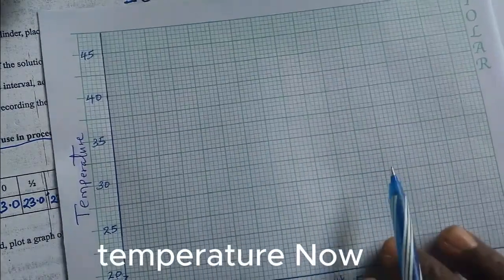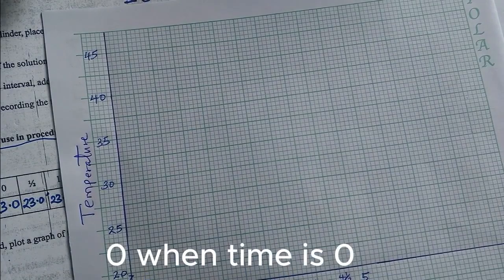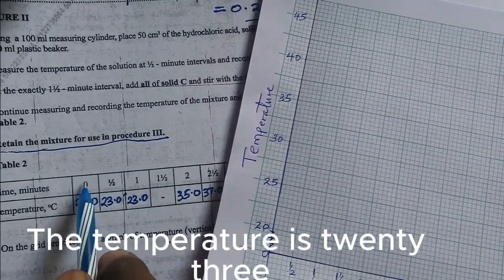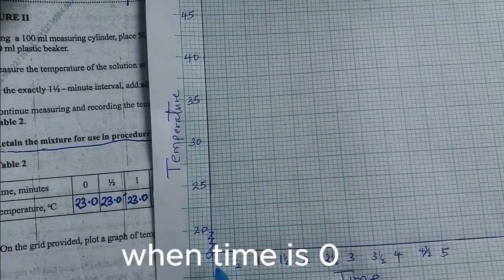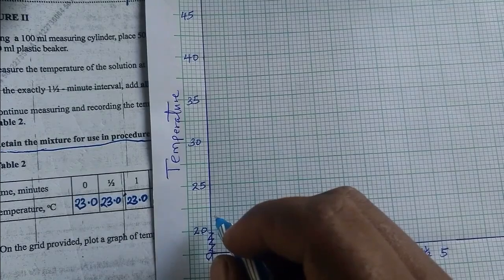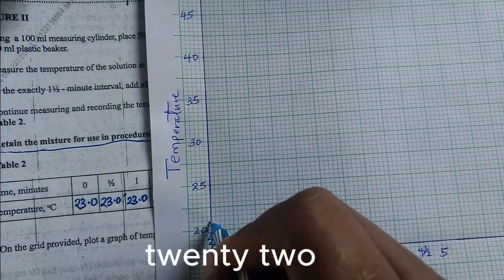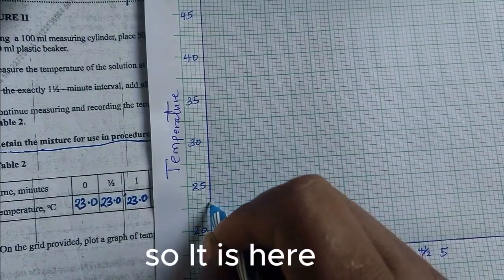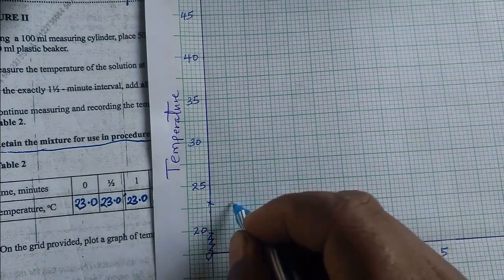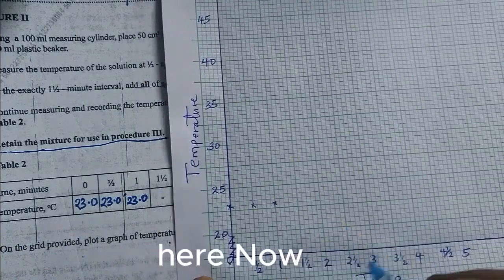When time is 0, you can see the temperature is 23. So this is 20, 21, 22, 23. So it is here. Again, at a half, it will repeat the same. At 1, it will repeat the same 23 up to here now.